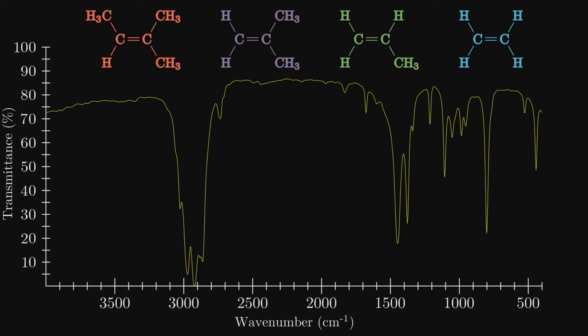All 4 molecules are very similar, and this teeny peak here is indicative of hydrogens on sp2 carbons, which they all have. However, the peaks below 3000 are caused by hydrogens on sp3 carbons, which means option D is out. Given that, we're not surprised to see the peaks on either side of 1400, which confirms there are sp3 carbons, but also CH3s on the molecule.